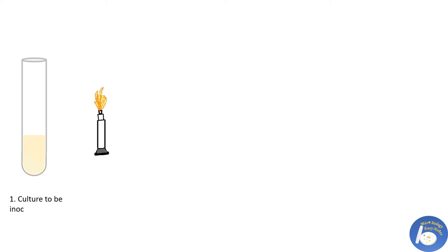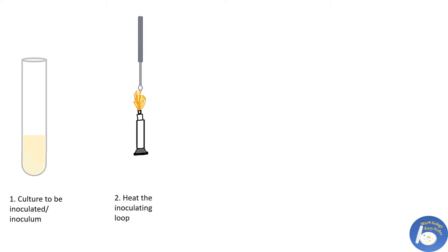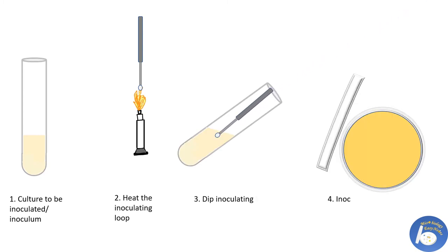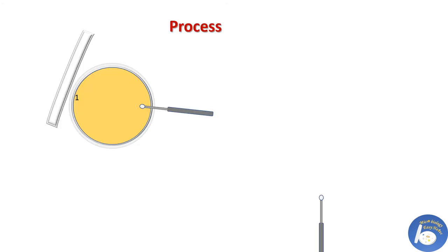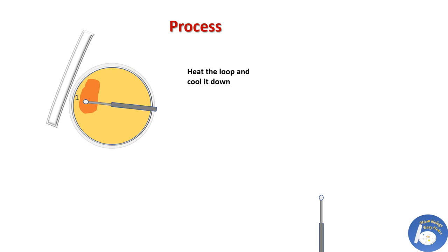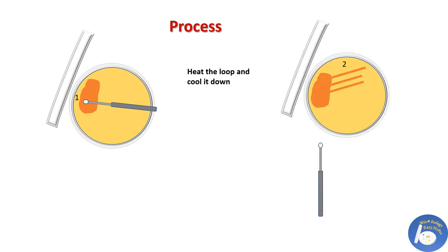Now we have a contamination-free Petri dish. Take the culture to be inoculated. Heat the inoculating loop in a Bunsen burner and cool it down for a few seconds. Dip it in the culture to be inoculated. Now the inoculating loop is ready to be streaked. Starting from the edge of the plate, lightly drag the loop and make a smear-like area. Be careful — do not cut the agar surface. Reheat the loop, cool it down for a few seconds, then drag the loop through the previously smeared area and streak two to three times, as shown in the picture.